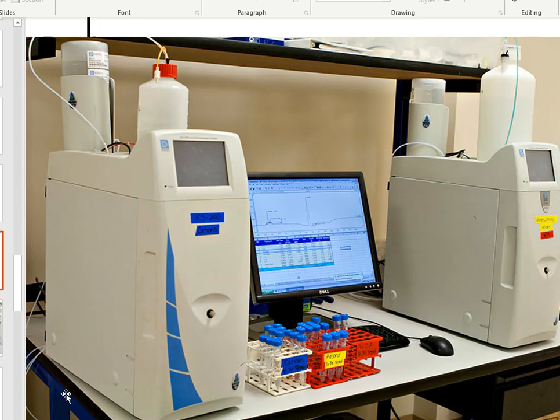The front ends of these Dionex systems will open up, and inside that area is where you'll see the column and the tubing and maybe access to part of the detectors. Over here on the other side, you'll see another Dionex IC system as well. Here in the front are a couple of trays. Those trays hold conical tubes, which are used to put samples in, so they'll be ready to go, and you can manually inject them one by one if that's what you want to do.